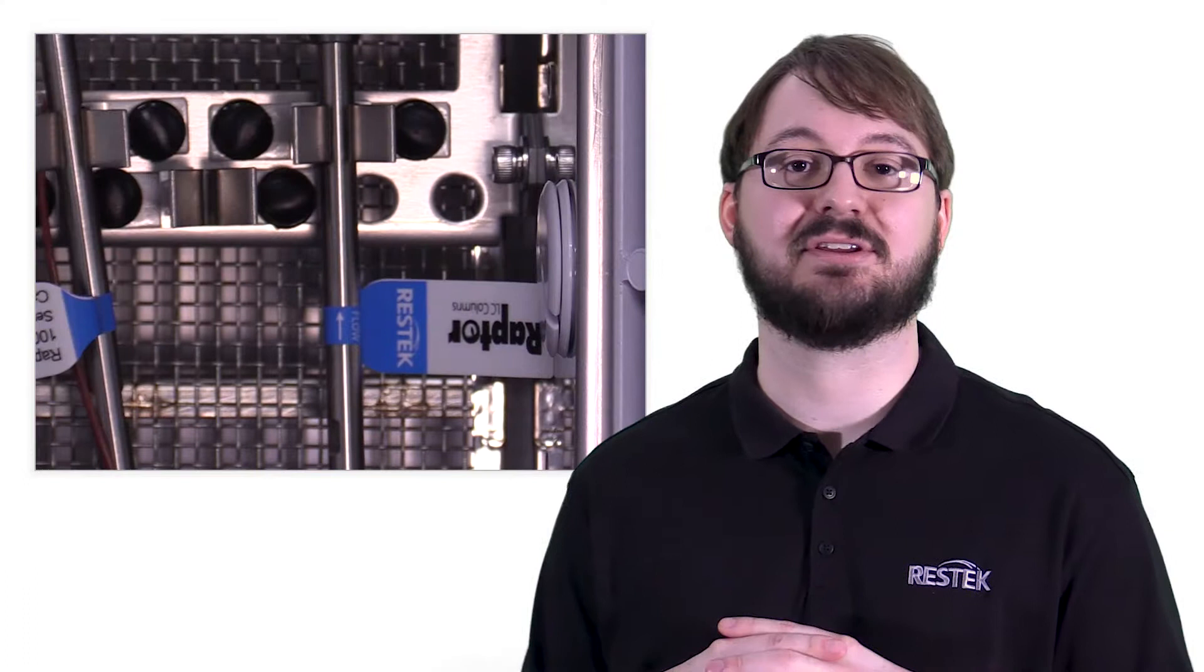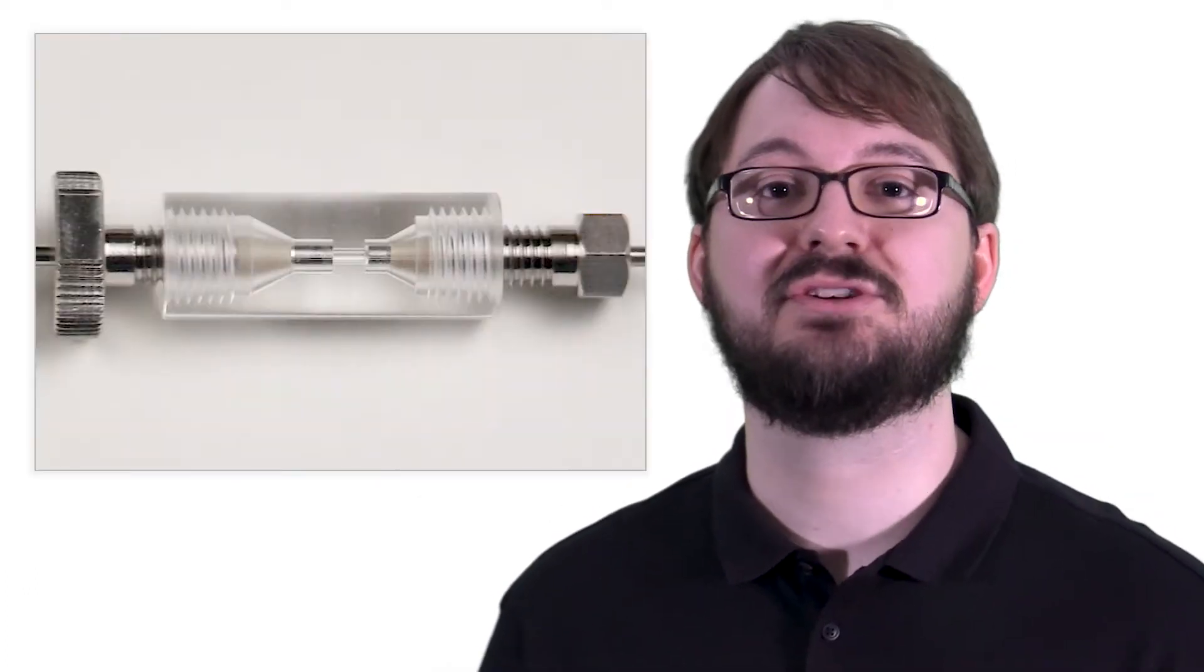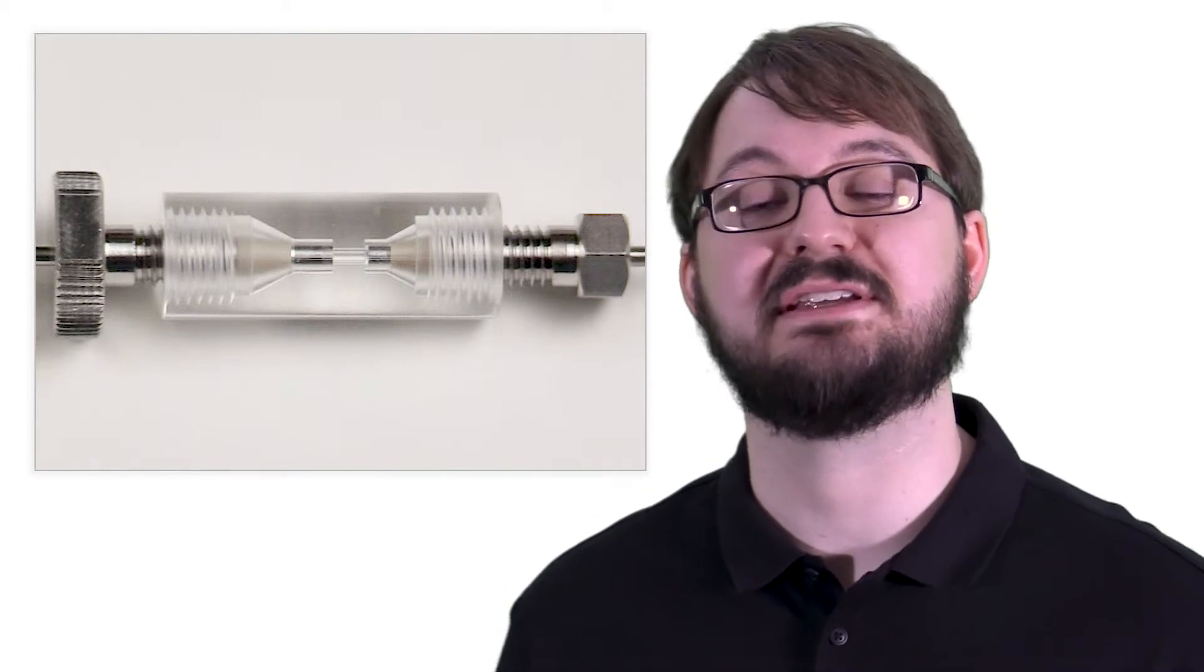Once you've chosen the appropriate fittings, be sure to check your column label for flow direction and insert your fitting into the column end. I like to push the tubing into the column as I'm securing the fitting. This ensures that a zero dead volume connection is made.